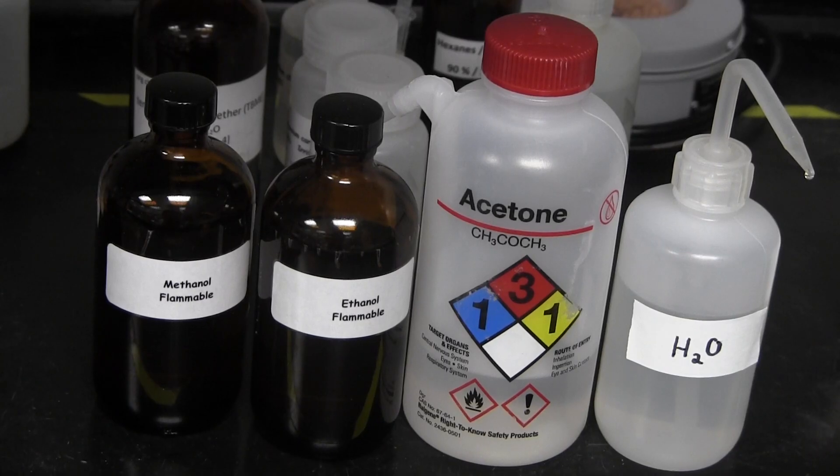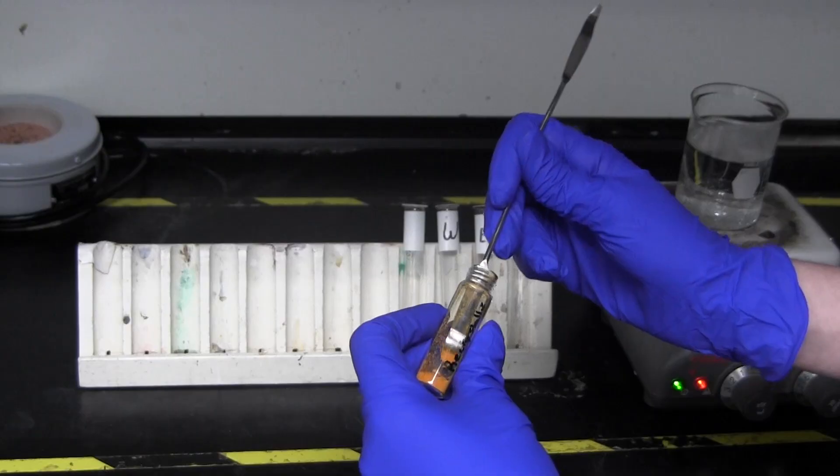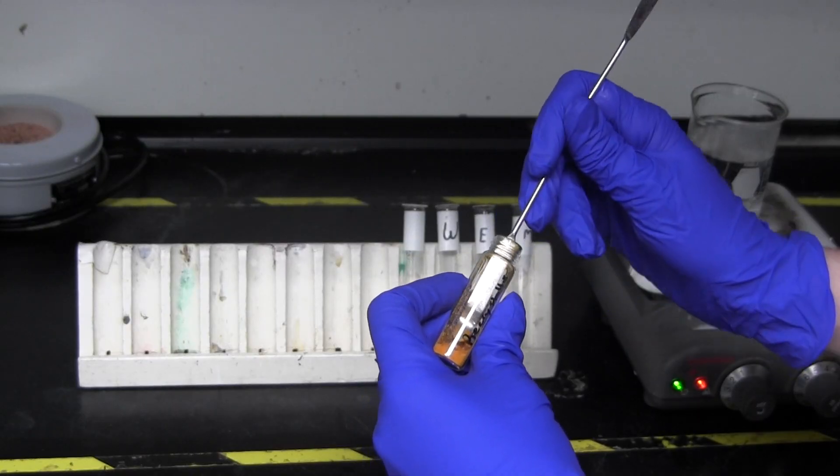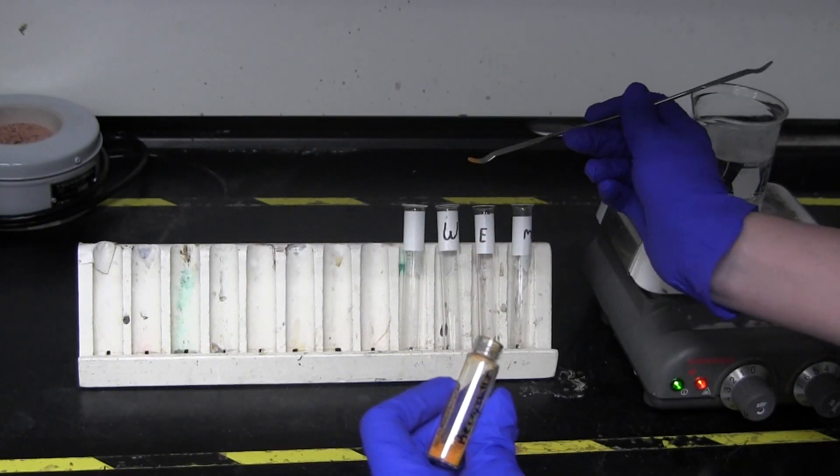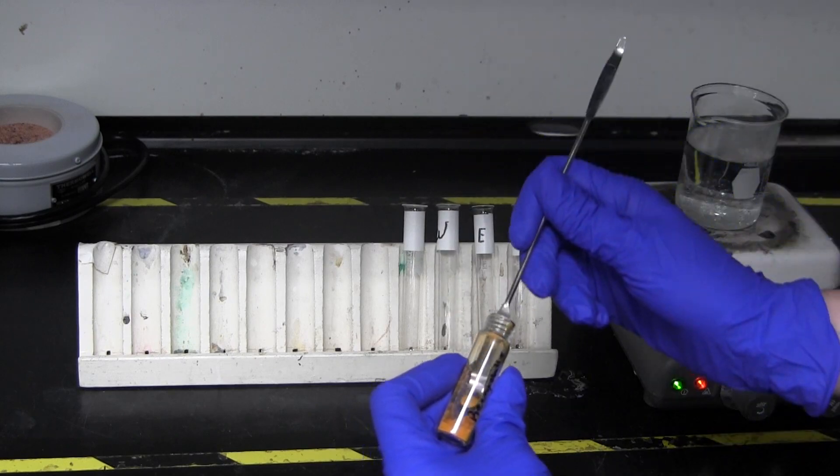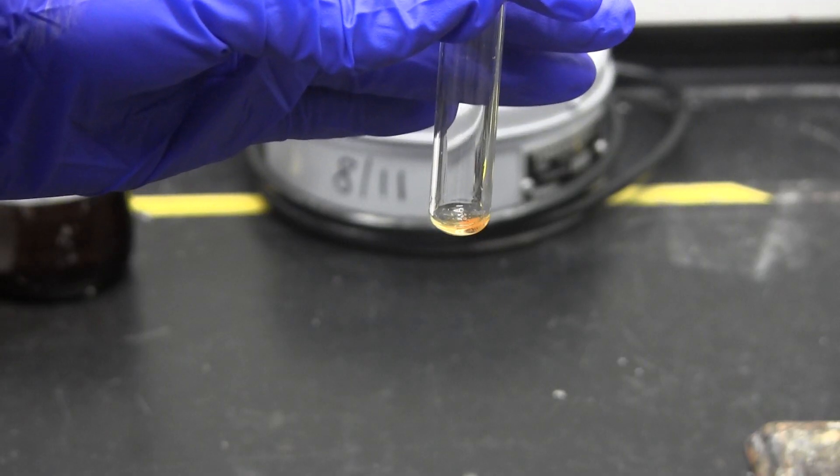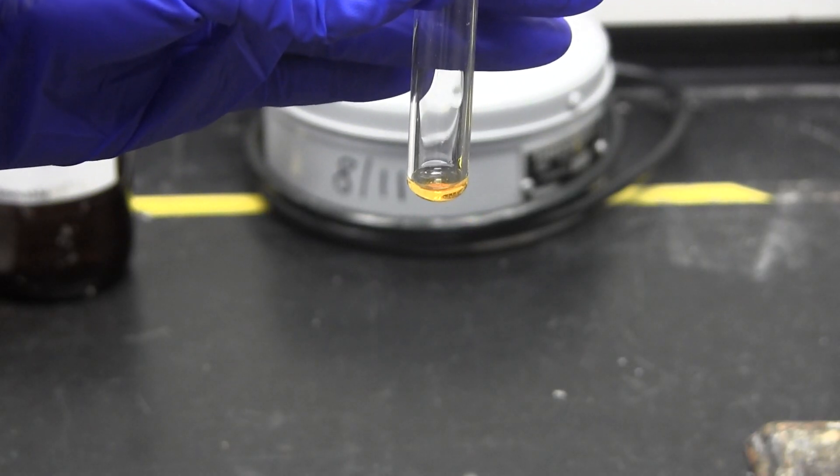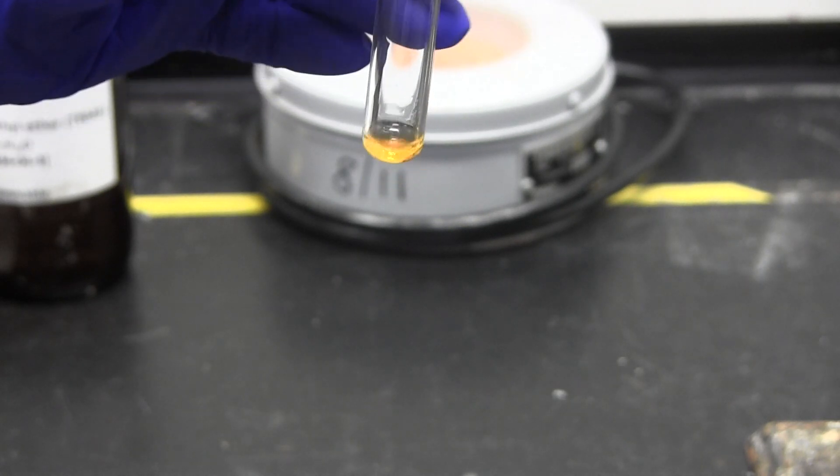First, you will have to determine the solvent that your unknown will work in. At room temperature, the unknown should dissolve partially or not at all. When heated, the unknown should fully dissolve into the same solvent. Test each of the four solvents to determine the best one. It is possible that more than one of them will work.